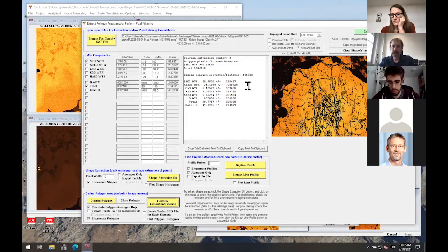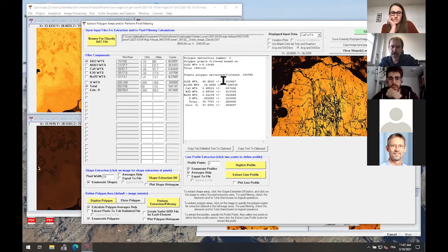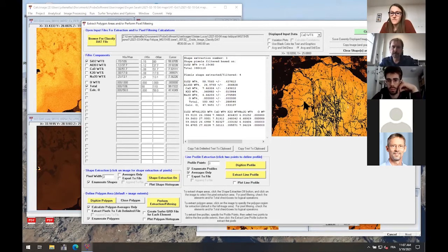And now I can choose here. This is the result of the sum of all pixels. This is your standard error. Oh, okay. I think it's hard to do better with a point analysis. Yeah. Now, if we take a pixel width of 1, I'm starting to extract information. I have here 1 point. This is the statistics I get on a 1 point analysis. Actually, these are 4 pixels. It cannot do 1. So it's 4 pixels, and you get extremely poor statistics.